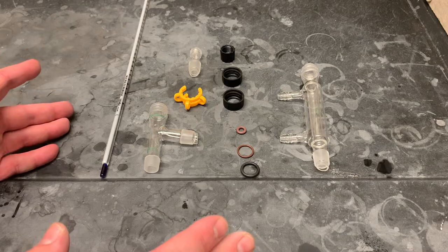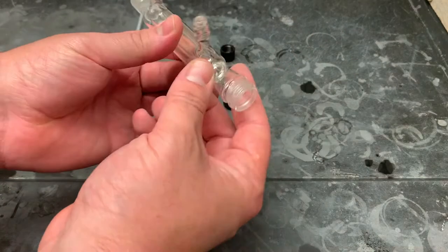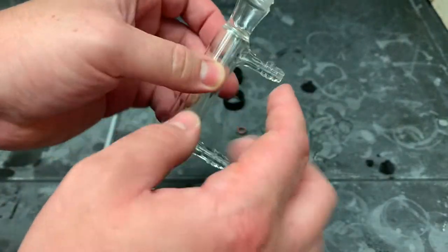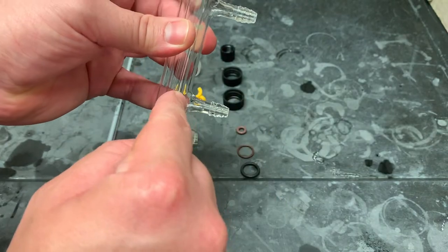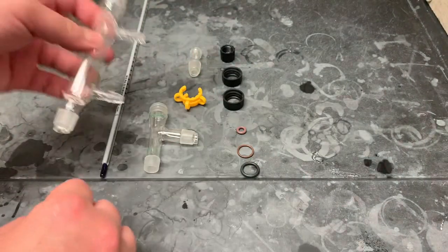Now at this point you should be used to doing these, but just in case you aren't, this is the distillation apparatus. I'm going to start by building that. We have here our water-cooled reflux tube. Remember, they are independent tubes, so the water comes in through the bottom, out through the top, and it can never get to that center tube, so you don't have to worry about that.